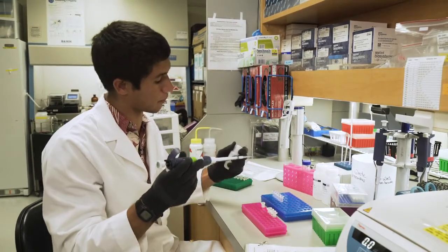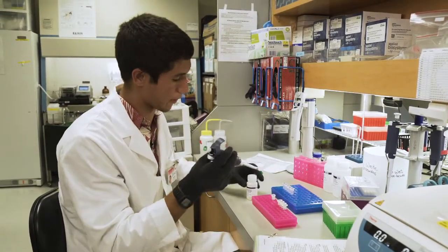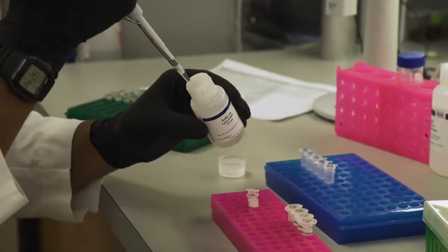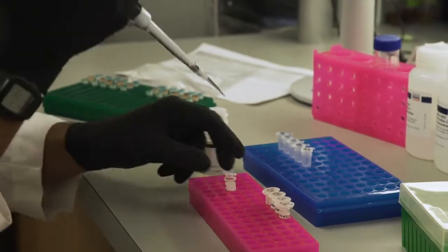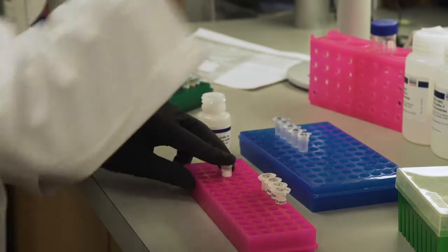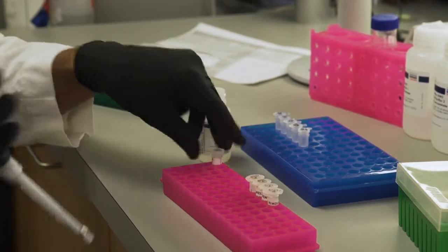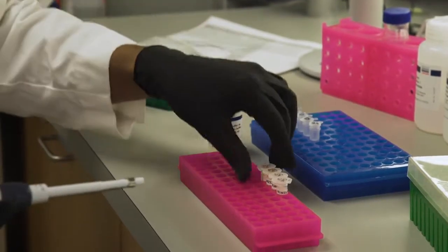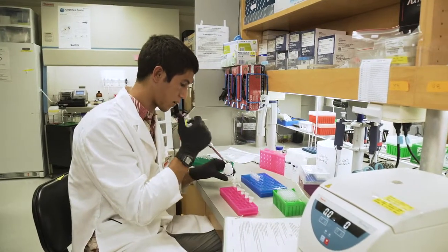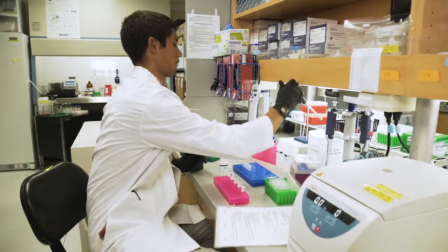What I'll be doing is taking 200 microliters of this buffer and putting it into each of our tissue tubes. Grab our 200 microliters, and there we go. Now, the tips are disposable, and you use a new tip for each sample to prevent any kind of cross-contamination, because we're trying to look at each of these individually. Take our buffer, insert it, draw our tip.